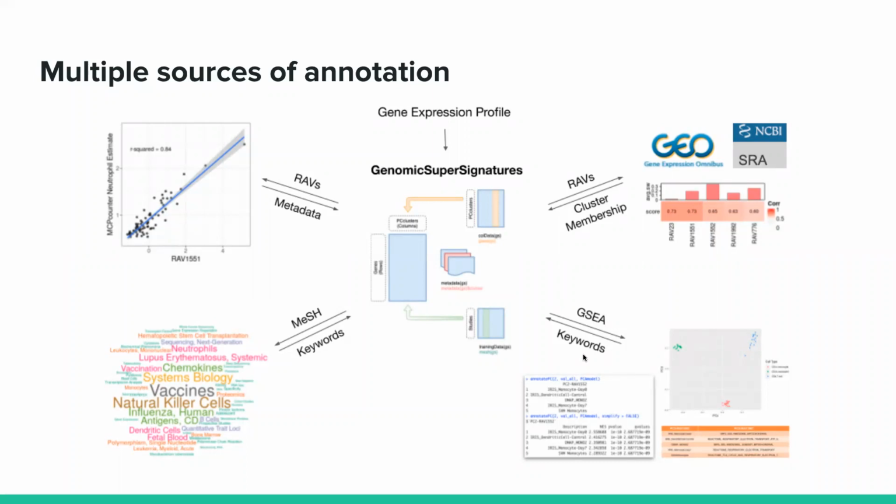So based on the order of the magnitude of loadings, each of these axes is annotated with gene sets. There are a couple of options that can additionally help you to interpret what that axis means.